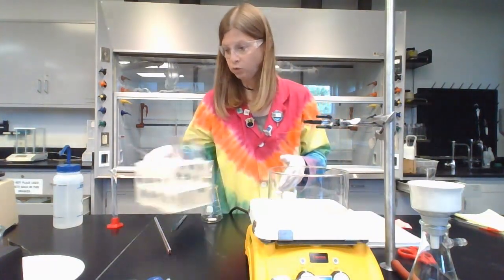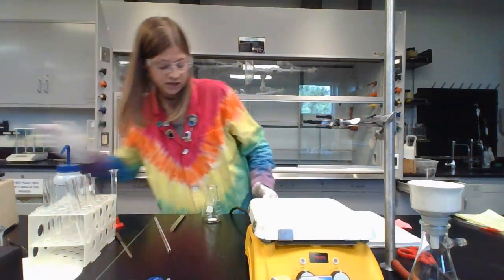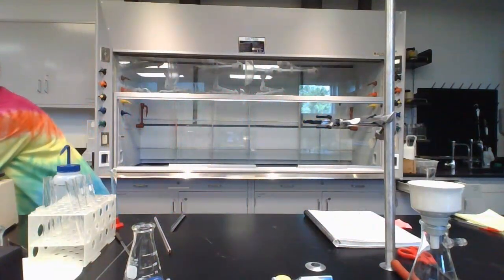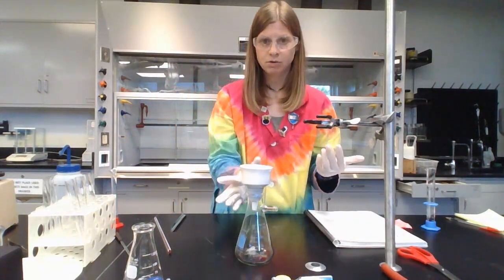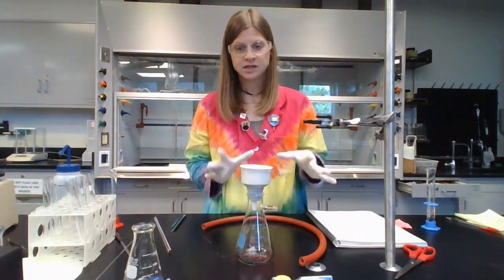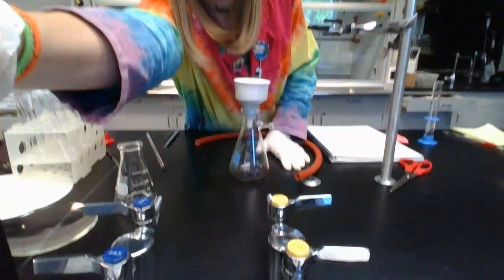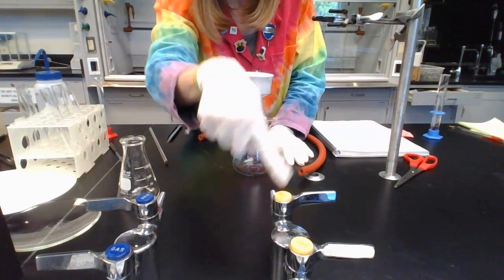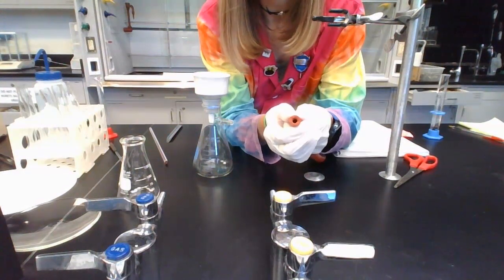While it's doing its 10 minutes of cooling, we're going to get set up for the next step. And the next step is for us to filter out the solid aspirin, hopefully aspirin, but the solid product, from the liquid, because we're trying to figure out not just did I make product, but how much product did I make. Okay, so we're going to filter it using what's called vacuum filtration. This is a technique used in organic chemistry labs, so this is an exciting thing. So on your lab bench, you will have some outlets. The ones that are yellow that say VAC on them are vacuum. Okay, we're going to be using that. So you're going to get a thick walled piece of tubing.